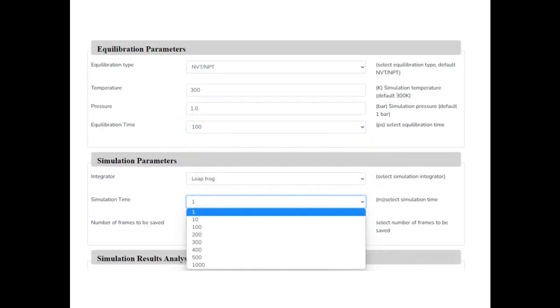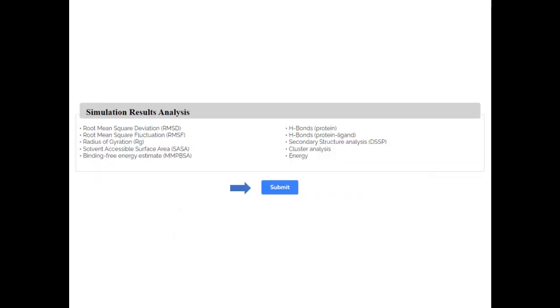Select required equilibration time and simulation time, then click Submit.